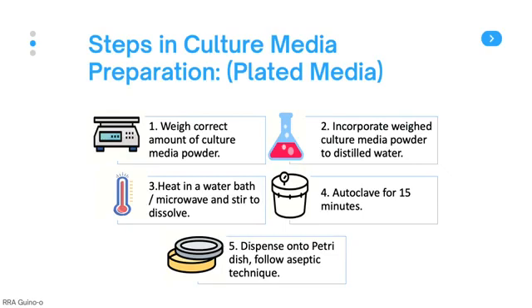Make sure when you're doing this, you add the powder first into your beaker or your flask or your reagent bottle before you add the water. This is to prevent the media powder from sticking to the sides of the vessel.